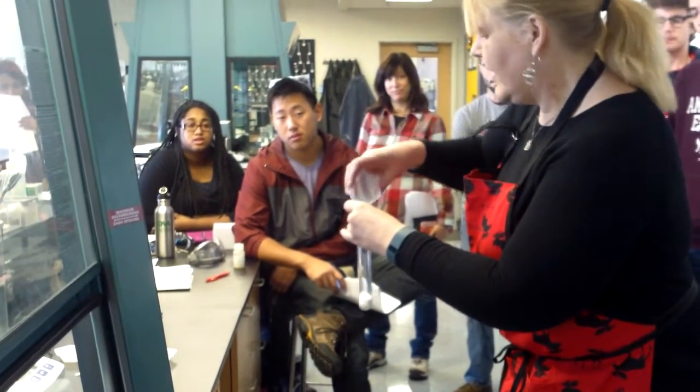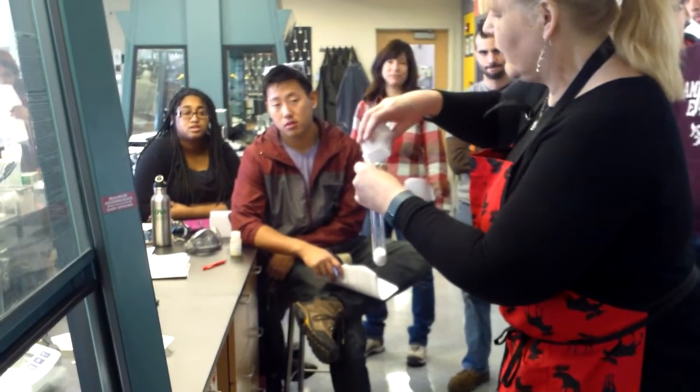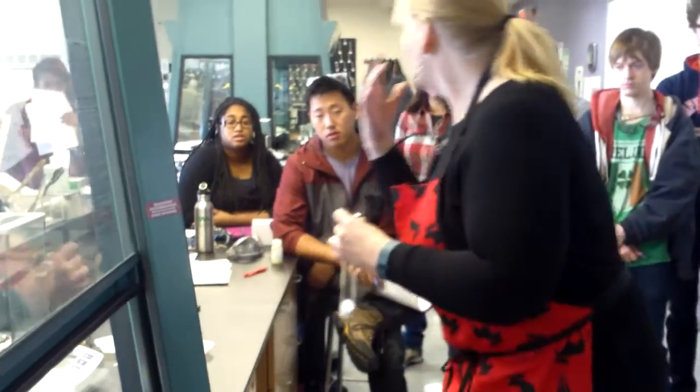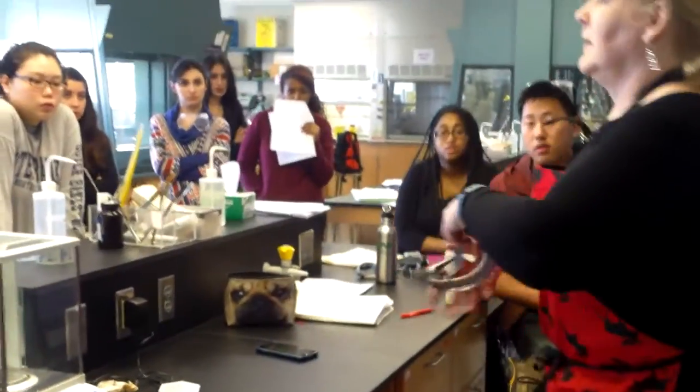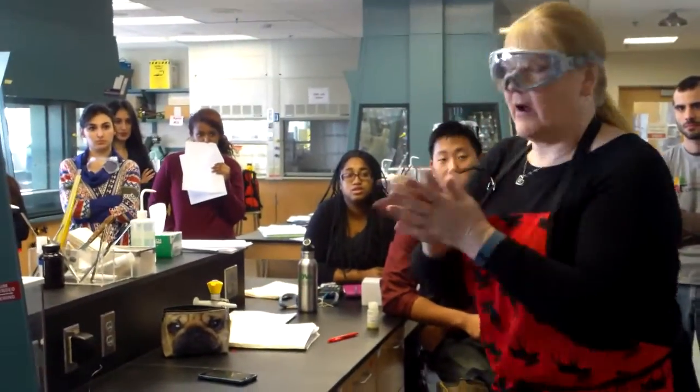Try not to pour it all in. Obviously, you're going to get a little bit left over in your container. We can't fix that. And you're going to just leave it there. Make sure, of course, that at this point, you have on your goggles. Fantastic. I have my goggles on.